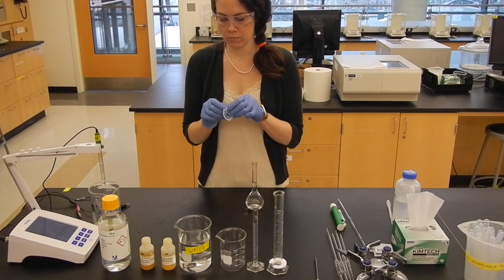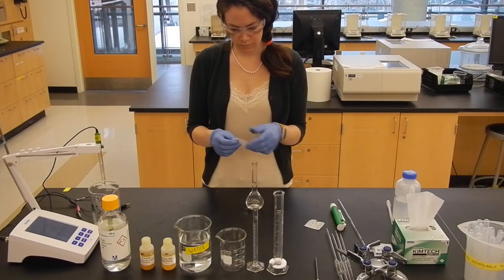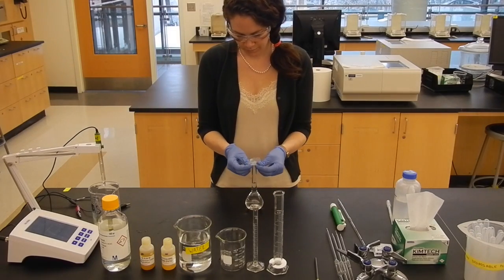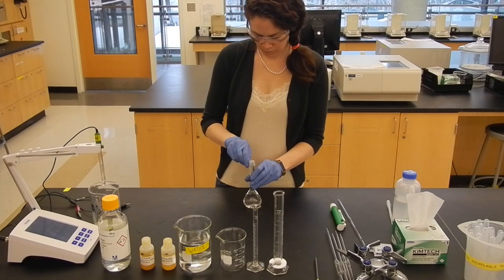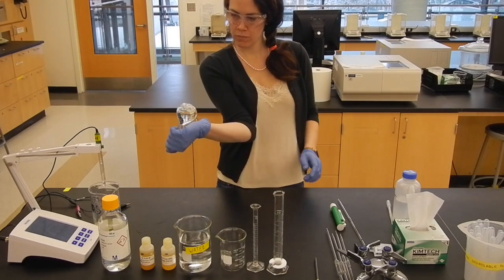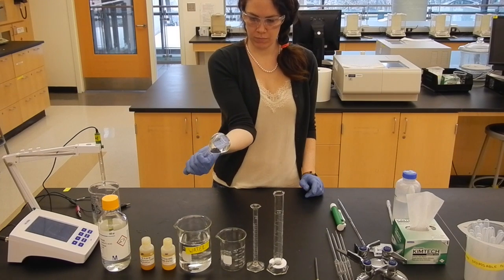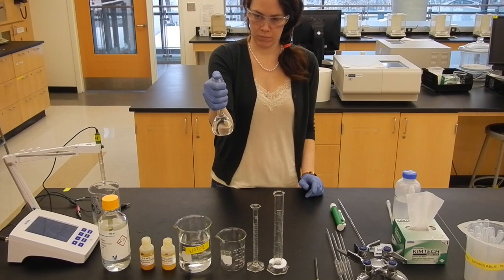Place parafilm over the top of the flask, making sure that it is well sealed. Thoroughly mix the solution by inverting the volumetric flask several times before pouring it into the reaction beaker.